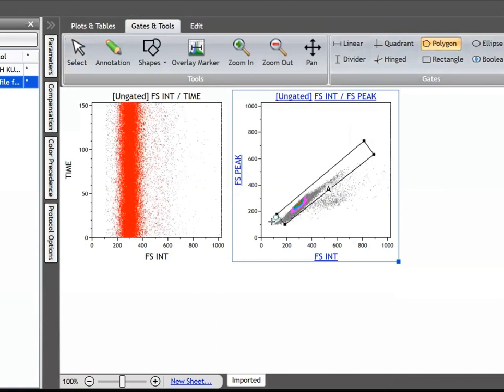So I'm just gating this, and excluding this particular population. I'm drawing a region here. See, even I am using that word gate. You can use it too, but if someone asks you what the difference between region and gate is, you should be able to say. So I've drawn a region around the singlet.